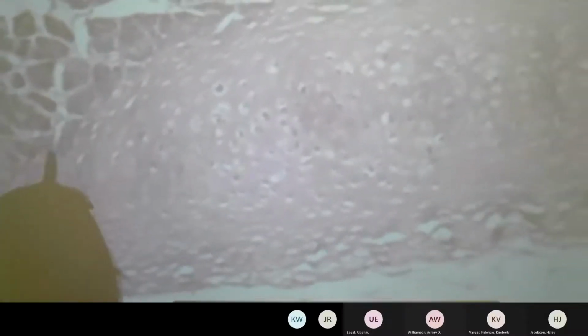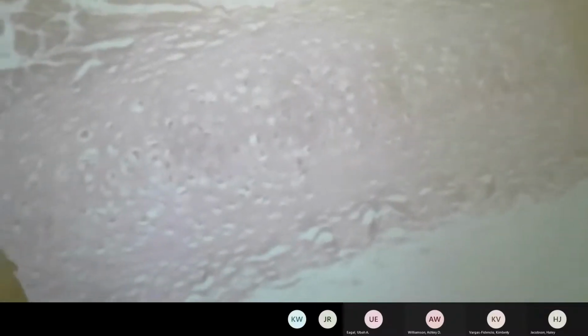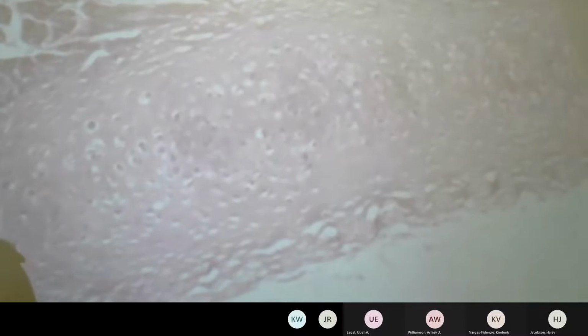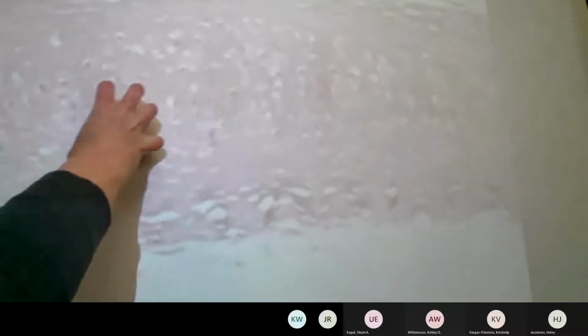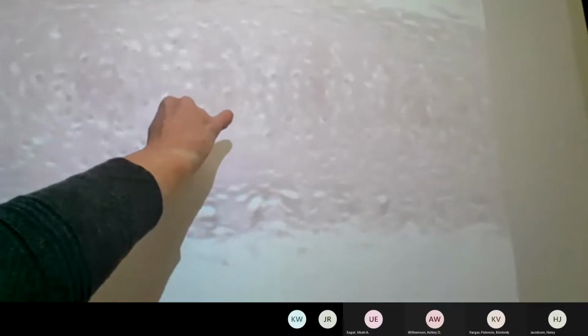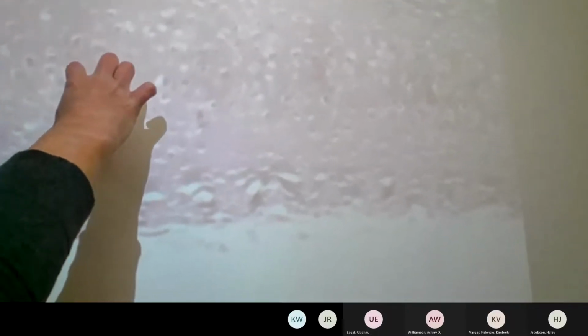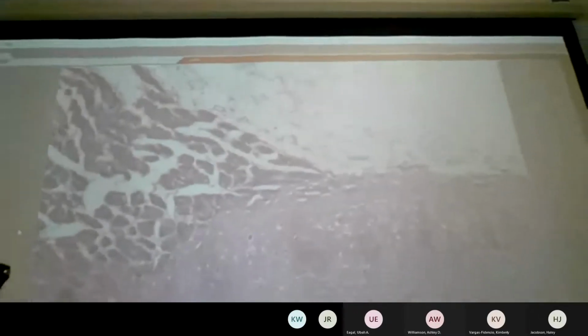Okay, so remember that cartilage, you're trying to find a place where the matrix looks a little thicker. There's no blood vessels. And your chondrocytes are living in these little chambers called lacunae. So here in this picture, this area fits those definitions. The matrix seems a little thicker. The cells seem to be sitting in these little chambers, and there's no blood vessels in here. Okay? And I don't know that y'all can see that all well.